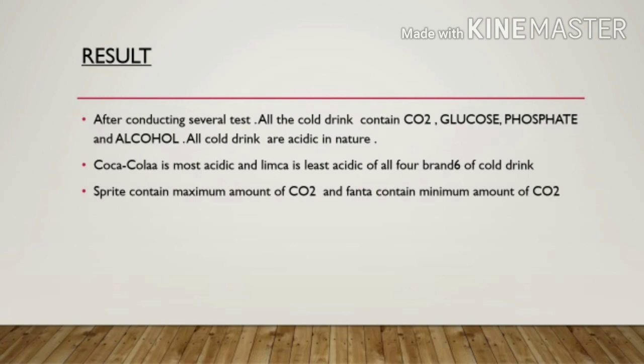Result: after conducting several tests, all 4 brands of the cold drinks are acidic in nature and contain carbon dioxide, glucose, phosphate and alcohol. Coca-Cola is most acidic and Limca is least acidic of the 4 brands of the cold drinks. Sprite contains the maximum amount of CO2 and Fanta contains the minimum amount of CO2. CO2 is also responsible for the tangy taste of the cold drink.